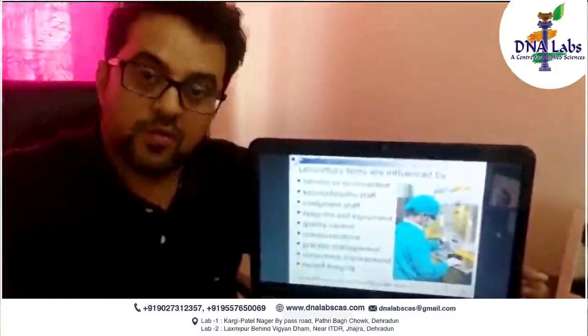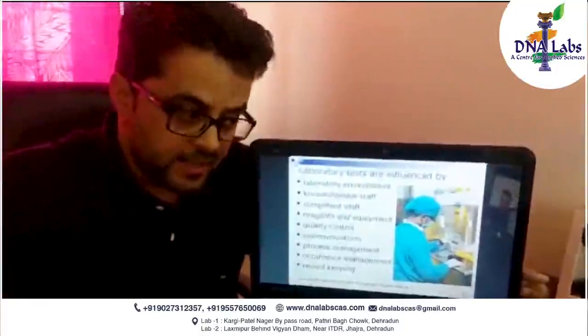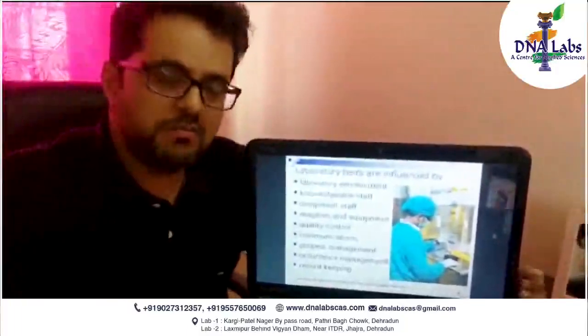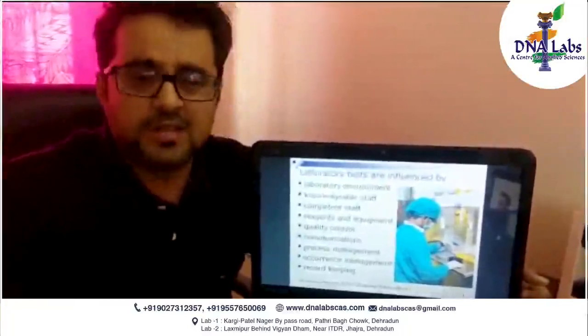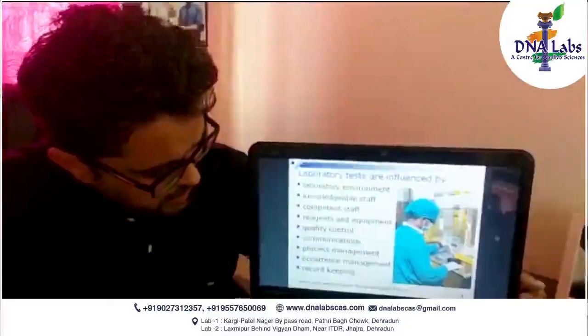Any kind of run, any kind of diagnostic test should be run with quality controls. Contaminations: microbiological contamination, pathological contamination, in clinical biochemistry, in cellular and molecular diagnostics, there are so many scopes of contamination that you have to take care of.